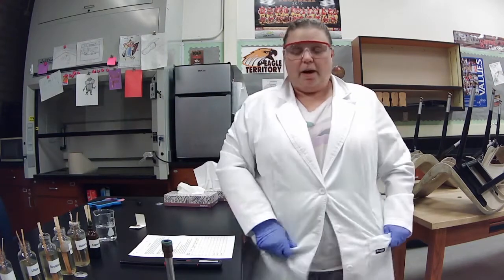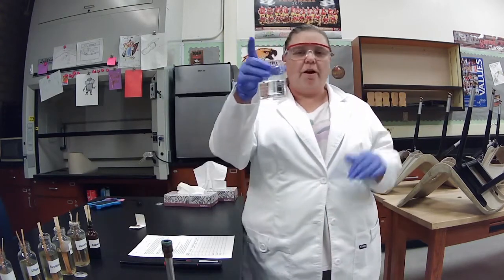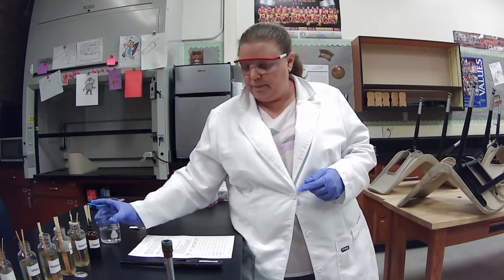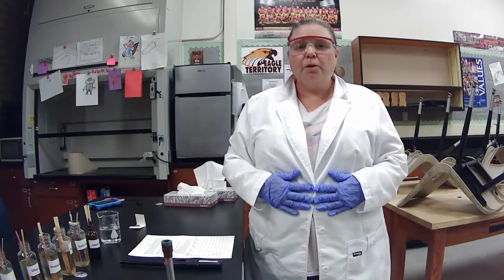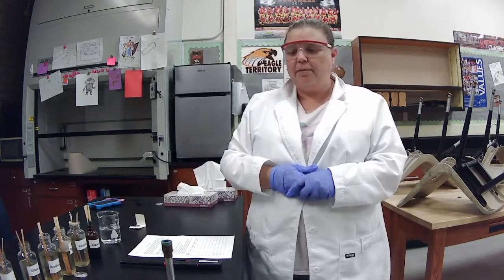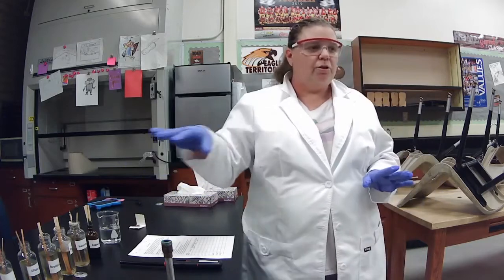Okay, so I want to make sure that I have all my safety equipment before I get started. I have my beaker of water to put anything that's burning in. I have my lab glasses, my gloves, my lab coat. My hair is tied back, and I have everything cleaned up just to where I need it. So I want to make sure that I'm safe first.